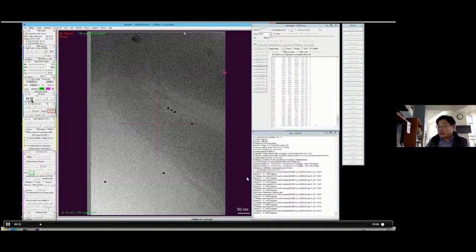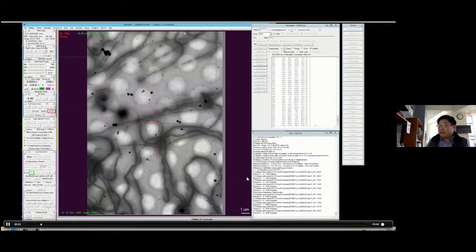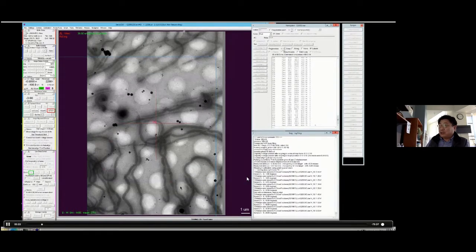As you can see from here, they go back to 0 degree and -3 degree to do tracking. Because of this back and forth, the stage is unstable, so typically there is a big shift. As you may notice here, at low mag there is such a big shift, and at high mag it will be a big jump.